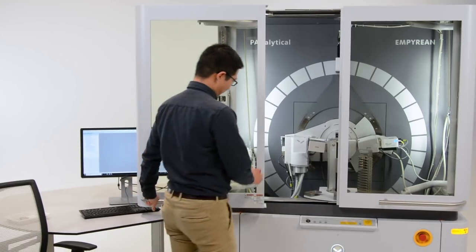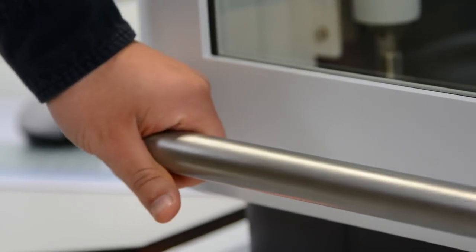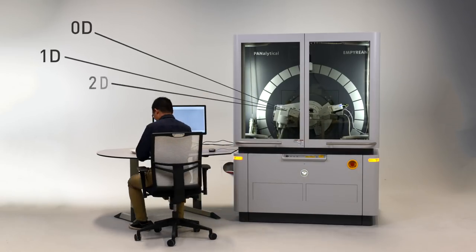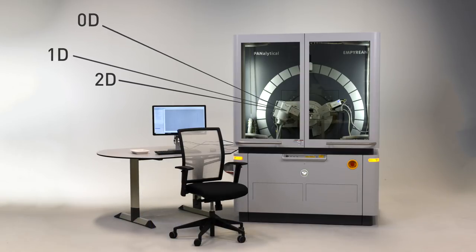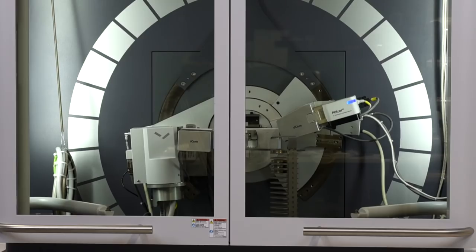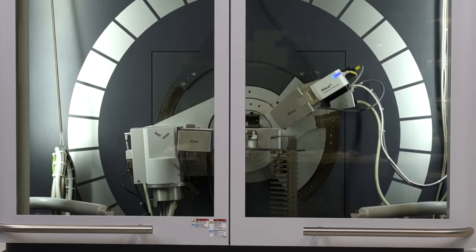Empyrean with multi-core optics is the only platform on the market that can seamlessly perform 0D, 1D and 2D measurements in a fully automated way, extending once more the dimensionality of your data set to unravel hidden features of your samples.